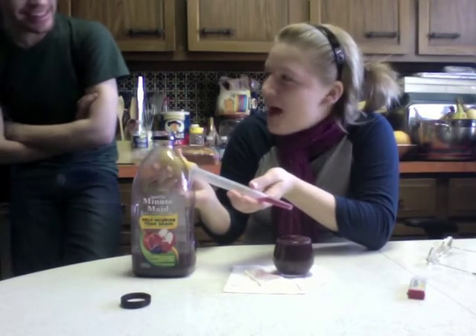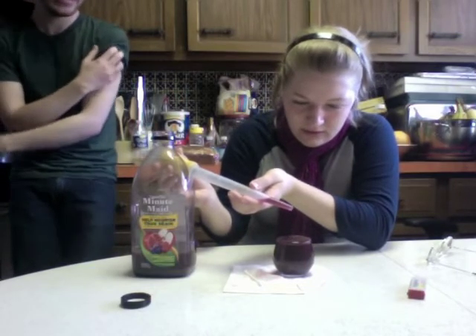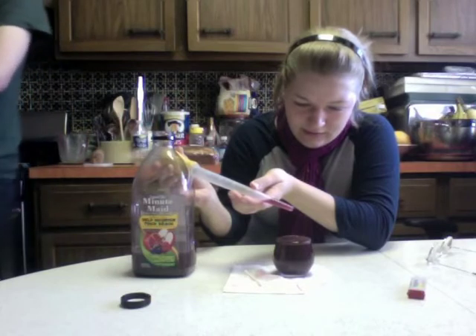We should be counting the drops — fine. Okay, hold on, start it out. One, two, three, four, five, six.